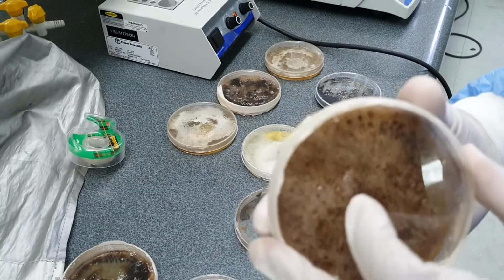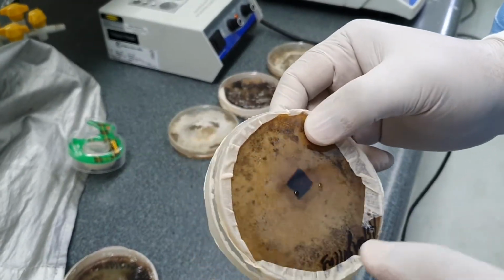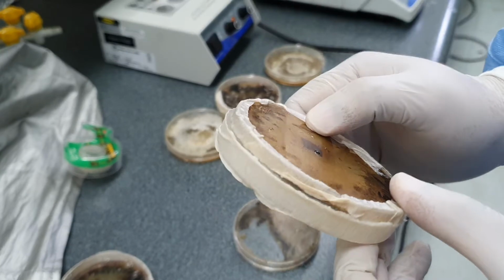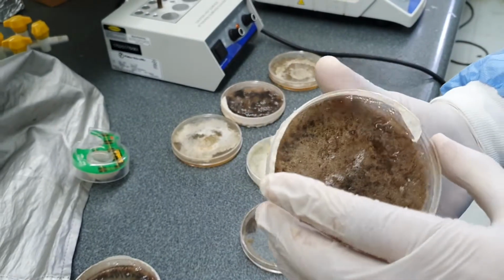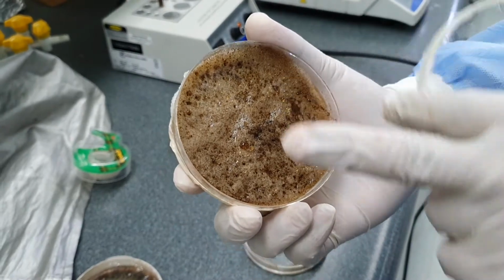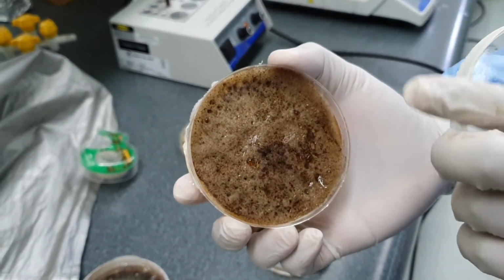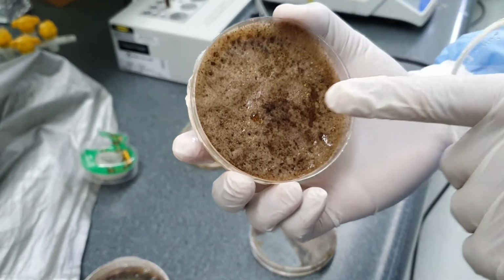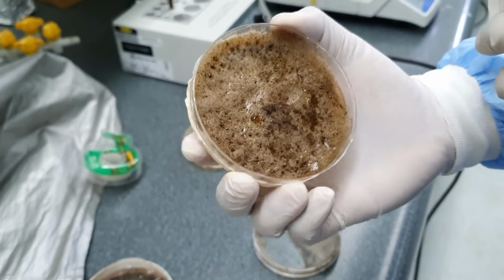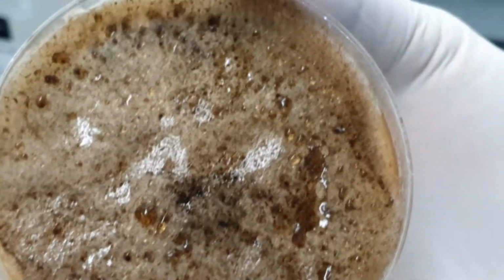So the petri dish contains nutrients in a solid medium that we place a part of the mycelia onto, and then that grows through elongation of the tip. What you're observing on the petri dish is the mycelia of the fungi, and you can't look at a single hyphae, but that mat of threads growing on the fungal plate is what we term the mycelia of the fungi, right?